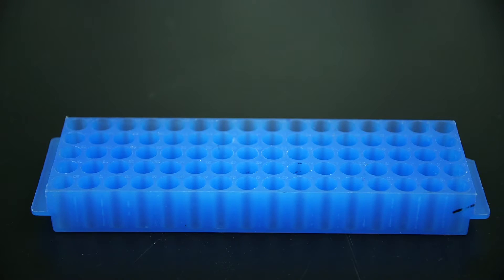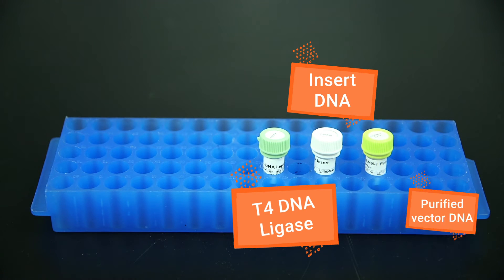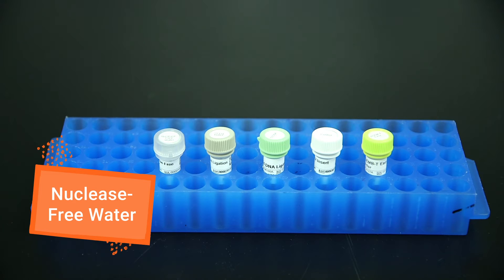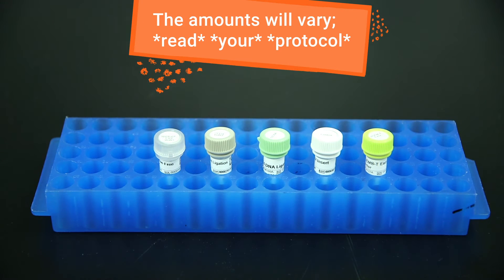To set up your reaction, you'll need your purified vector DNA and insert DNA, T4 DNA ligase, T4 DNA ligase buffer, and nuclease-free water. The exact amounts of these components might vary, especially the ratio of insert to vector.